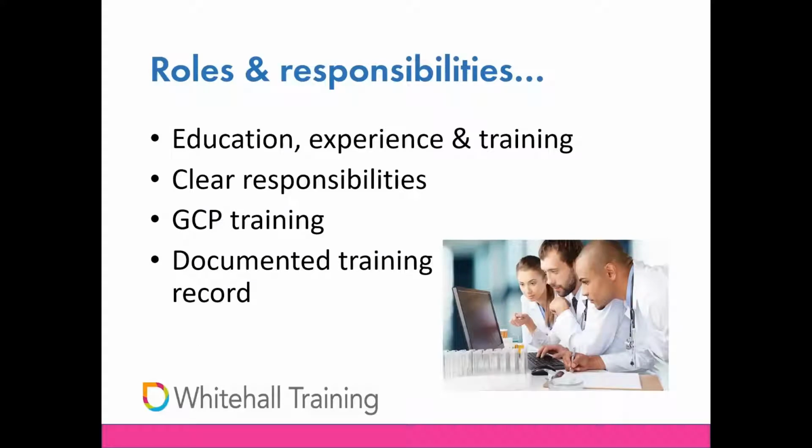In the training record, you should also include any certificates or evidence of courses, conferences attended, things like that, as well as a record of any in-house or on-the-job training. A signed copy of the job description could also be retained there. And this is a good indication that the individual knows what their responsibilities are.